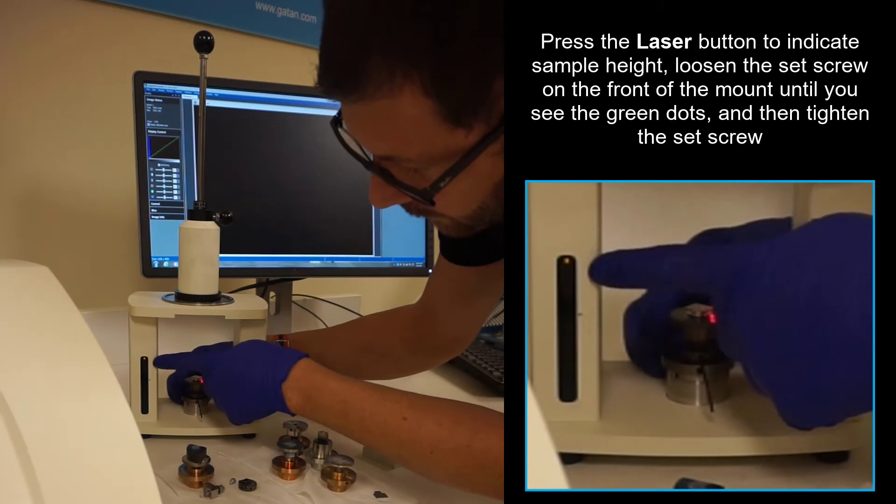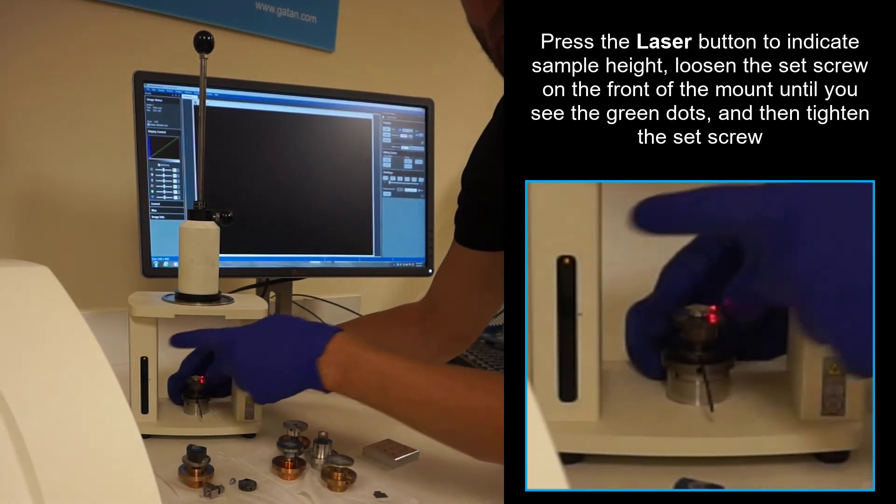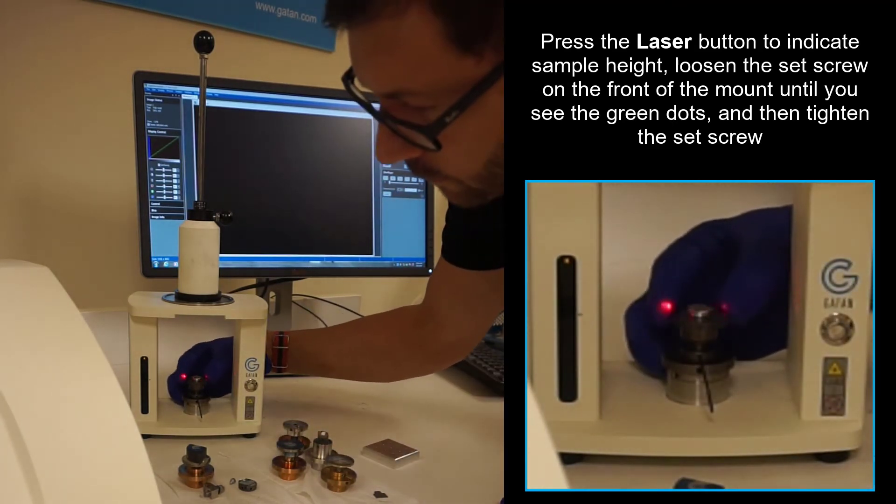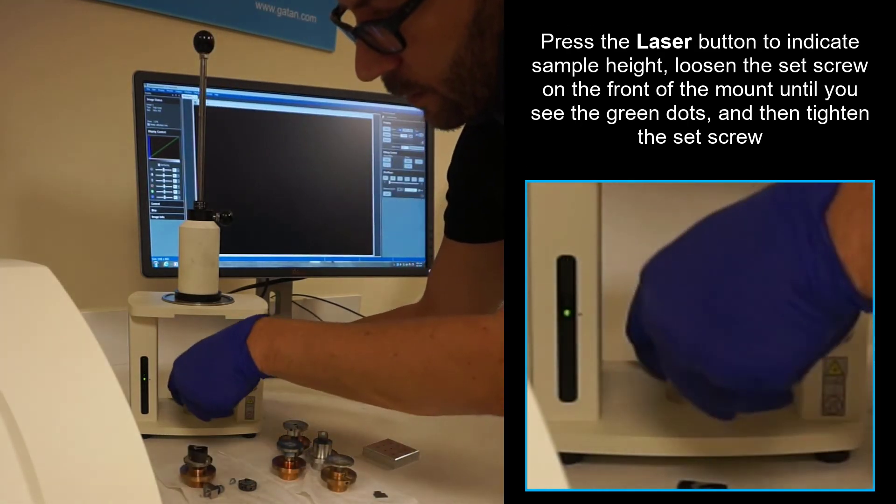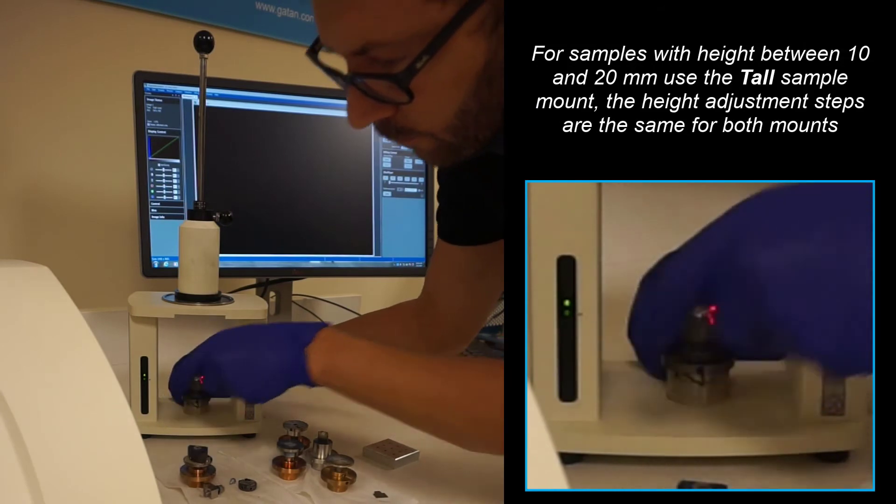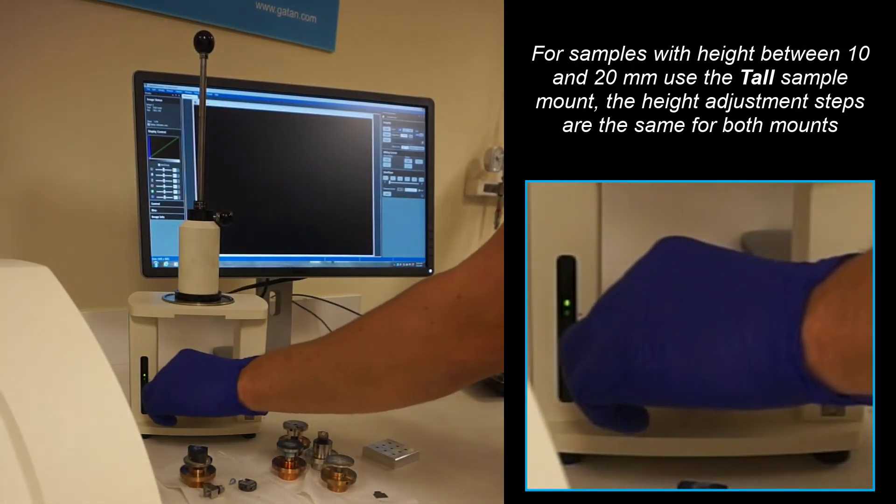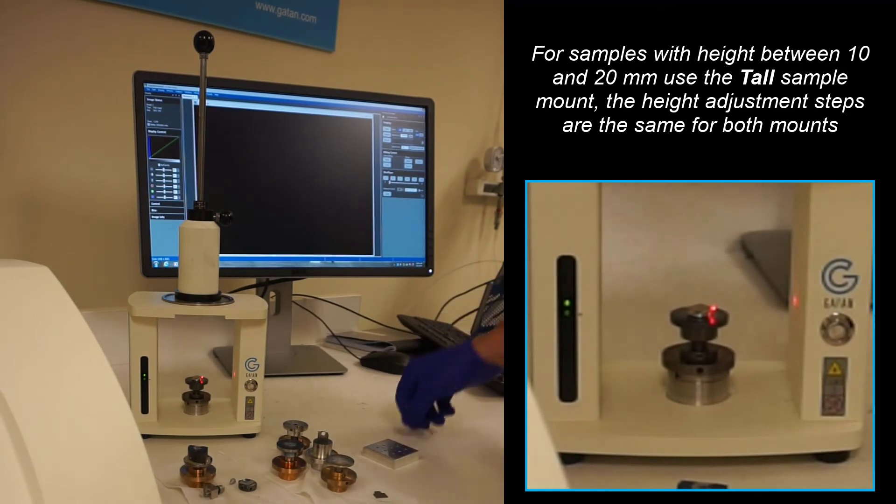Now we can follow these lights. Right now it's on yellow, which means it's a little bit out of place. We want to be in the green. Now we're in the green, tighten the set screw back.